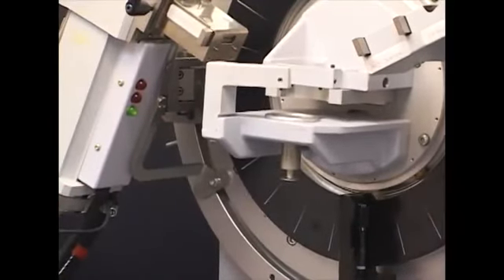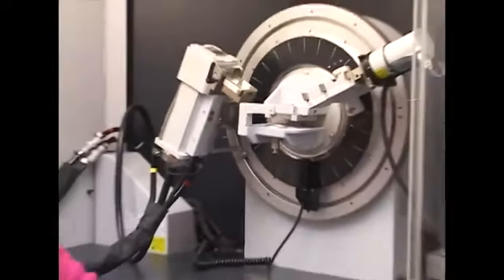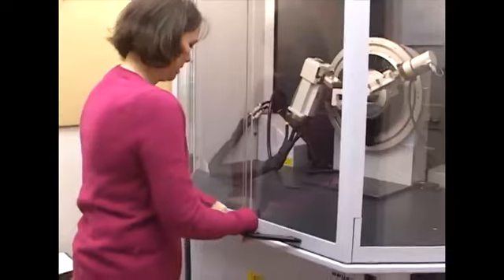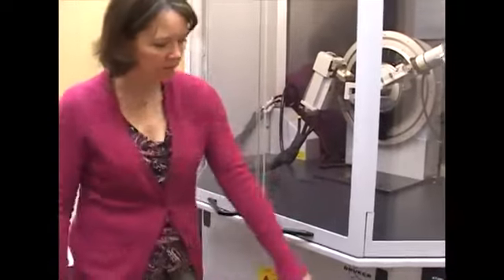When your sample's been removed, you can close the doors. No need to slam them. Verify the door's closed by checking the alarm light, and you're finished.